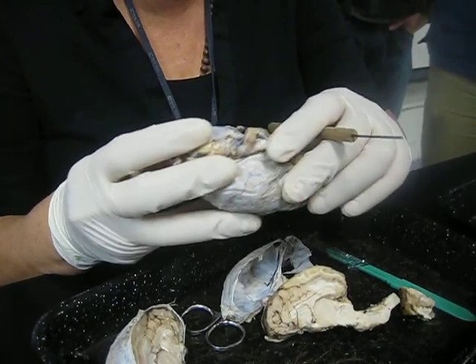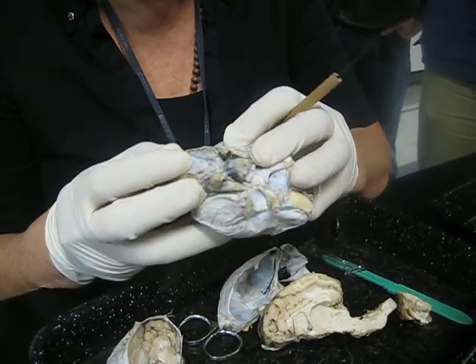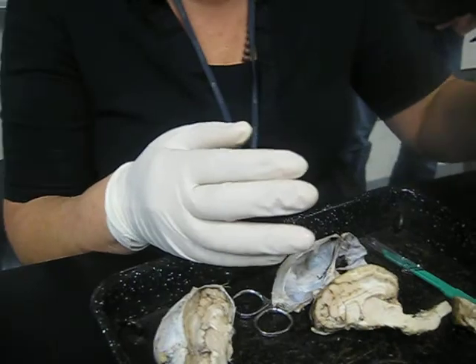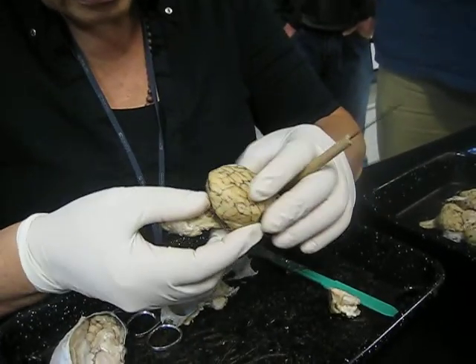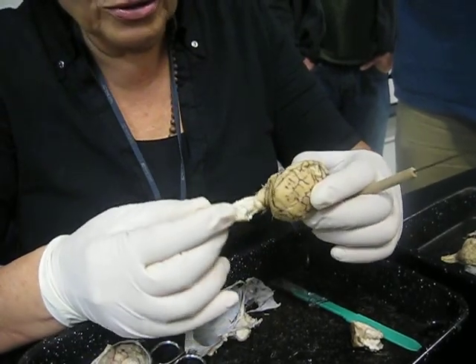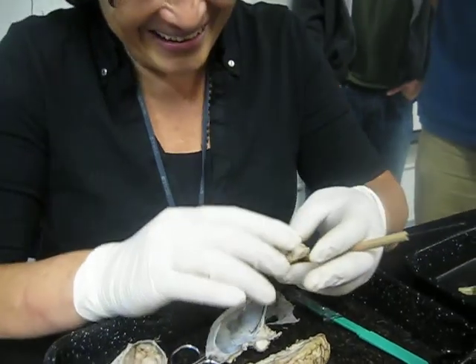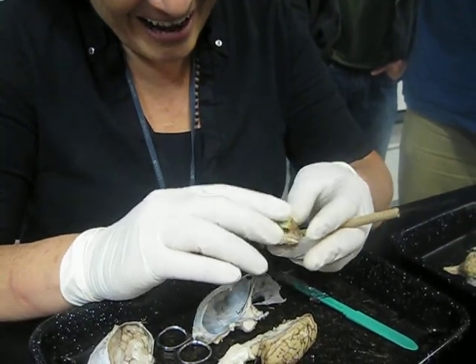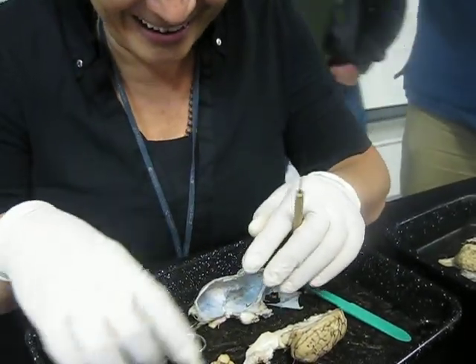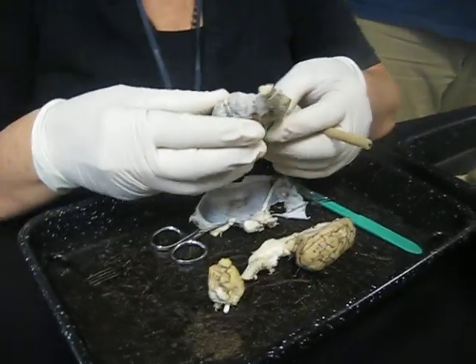Now, sometimes when I do this, I can show you cranial nerve 6. Sometimes I can't. Let me see if I can do it from this other. You guys, what did you do with your cerebellum? It's right there. I'm sorry. I never quite saw anybody take off the cerebellum. You did the same thing? Okay, well, we won't worry about cranial nerve 3 for right now.